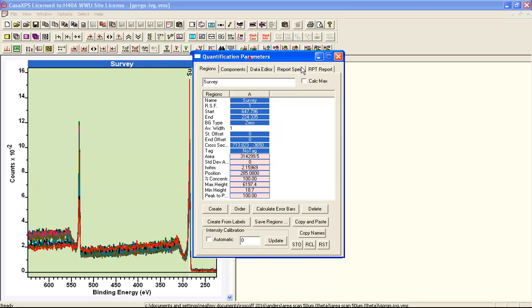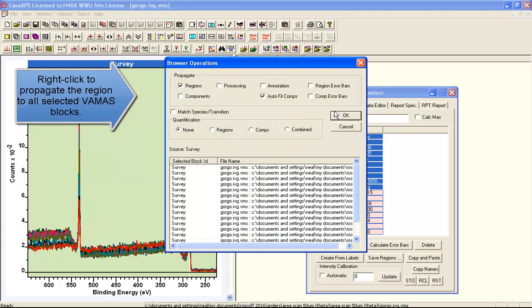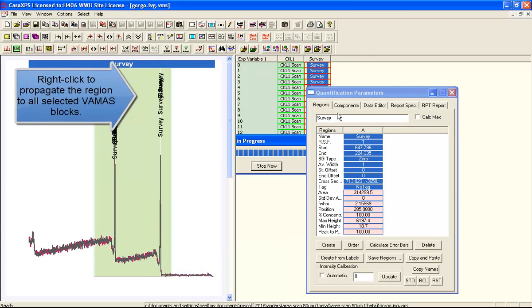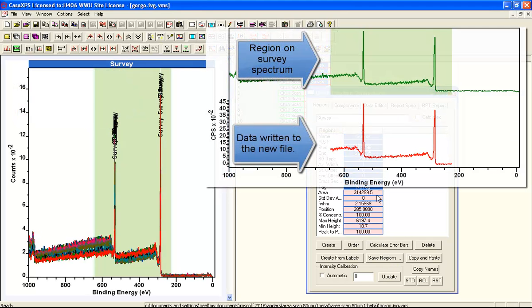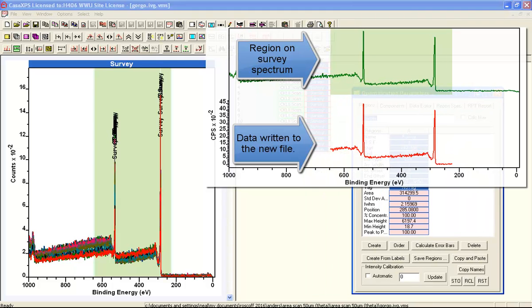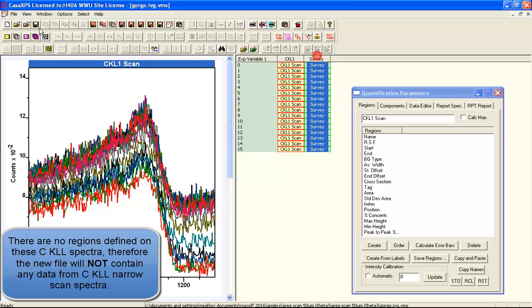And what we want to do is pull out from this array of spectra just an interval that's going to be defined by the regions that represent the peak structures and background that are of interest to us. So the entire survey data is not used when we do some kind of calculation.